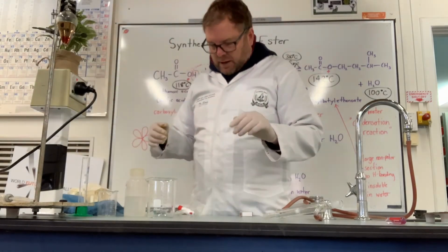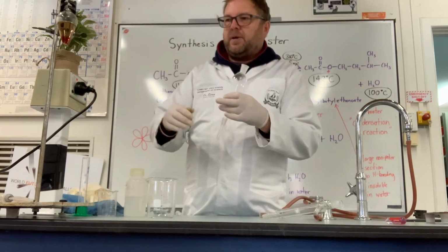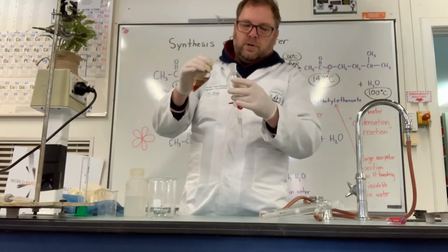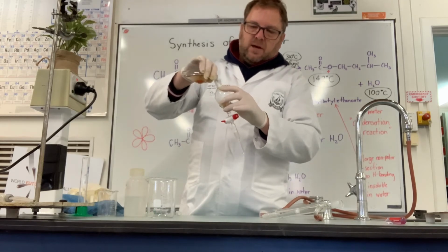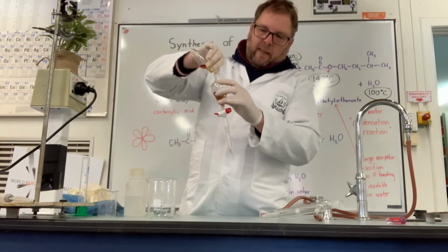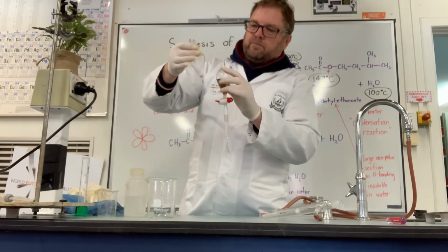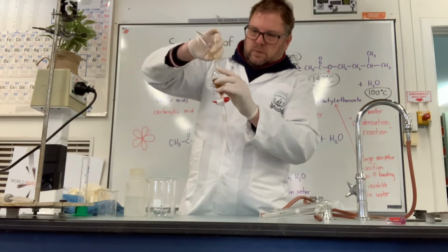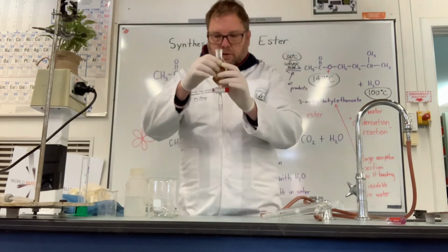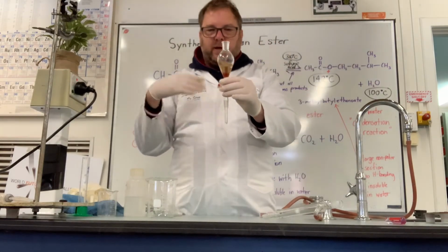Okay, back again. So I've got my separating funnel, the same one I used for the bromine with the alkene, so it's been cleaned out. And I'm going to take my reaction mixture here, which is still warm, but not too warm, and pour that into here. I do need to clean that out for the later part, but we'll leave that for a sec. Yeah, it's quite a strong smell. It has that banana smell.